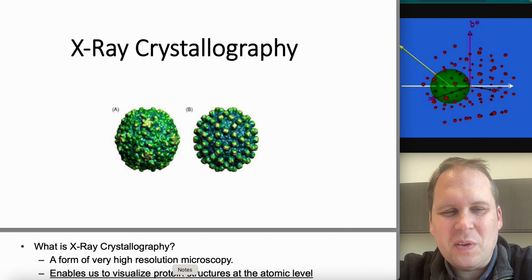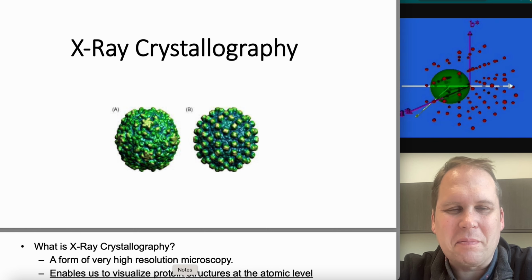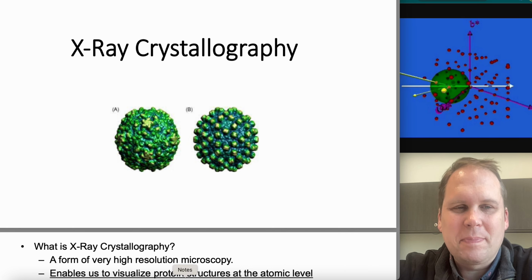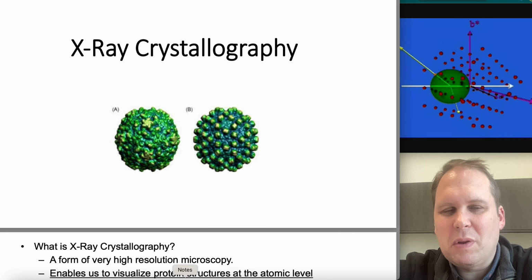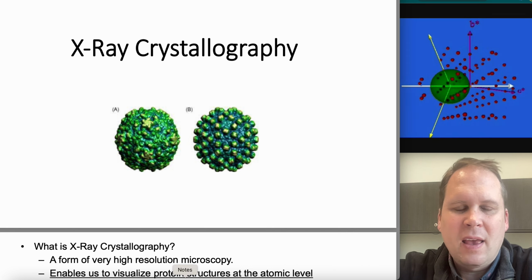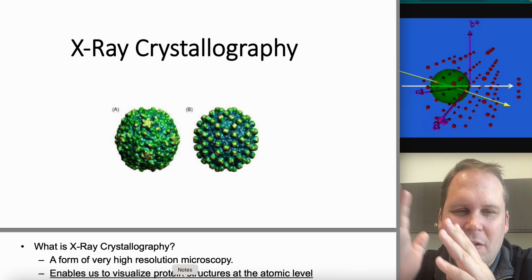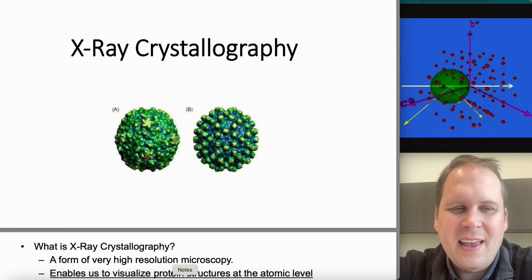Where does all of that good structural information come from? A couple of techniques, and we can break it down like this. If we had a time machine and went back 10 or 15 years, virtually all of the known structures come from X-ray crystallography, like this.